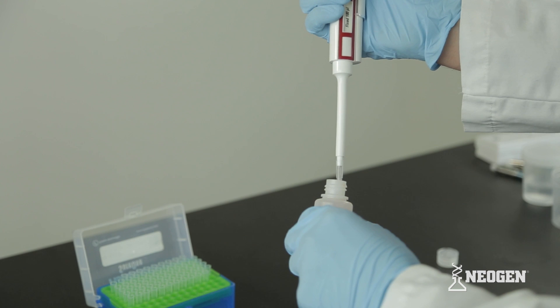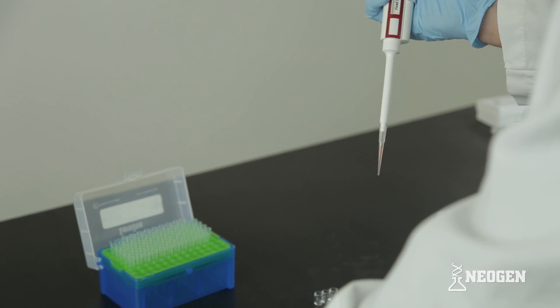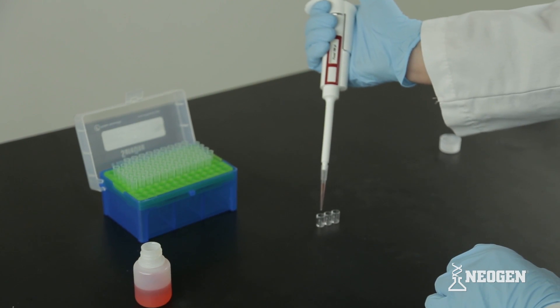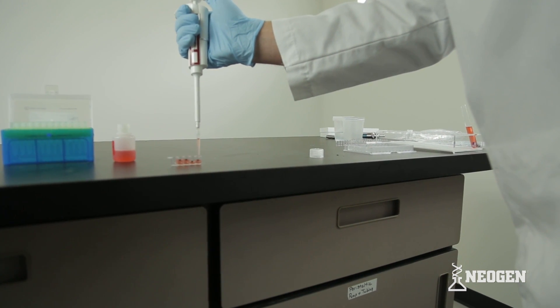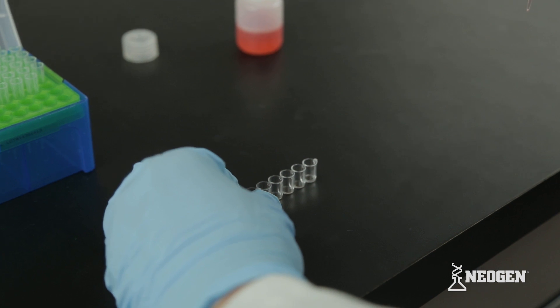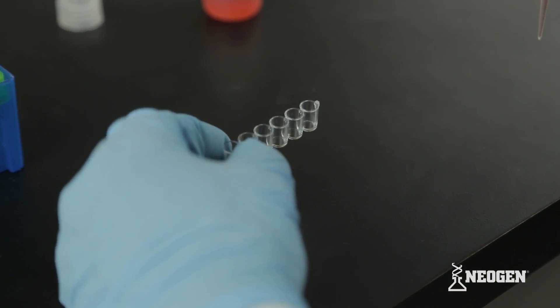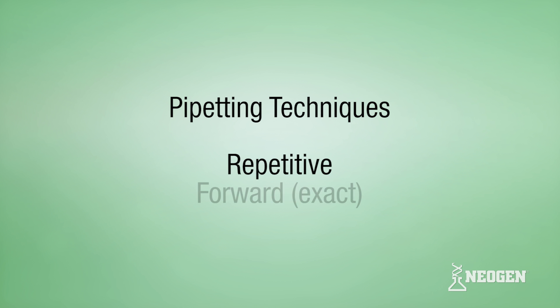There are different methods to ensure the correct volumes are dispensed with these pipetters. Any of these methods are acceptable as long as good pipetting technique is followed to ensure consistent, accurate liquid volumes are dispensed. The different methods include repetitive technique, forward technique, and reverse technique.